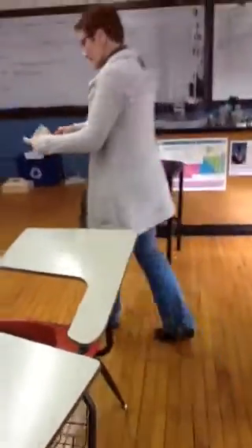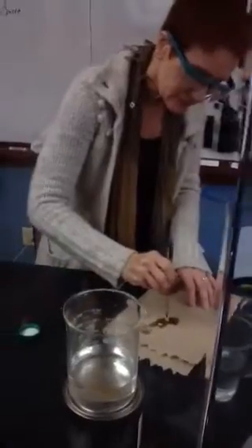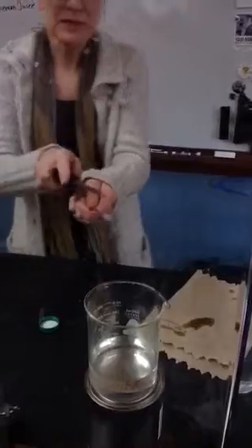Okay, so I'm going to go drop this into water. You can come up — you guys can come up here. Just stay on that side of the shield. Put my safety glasses on. Okay, and we'll get all three of these pieces together here and put them in the water.